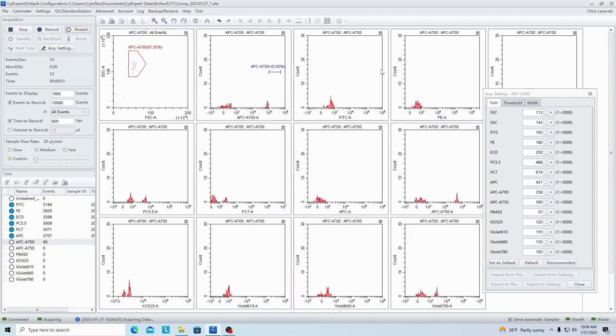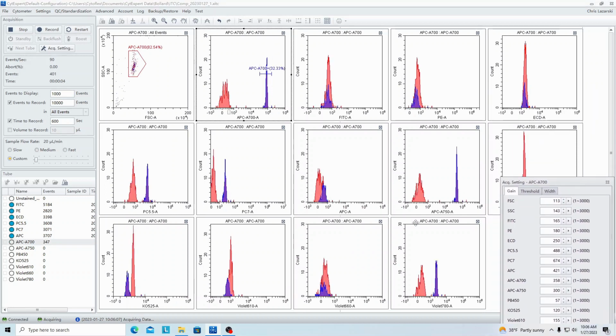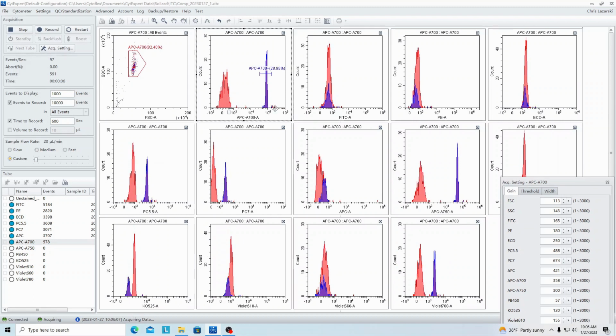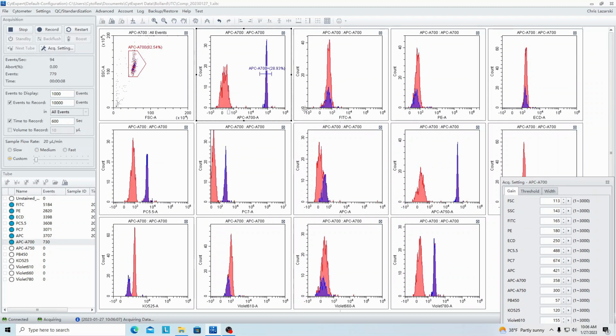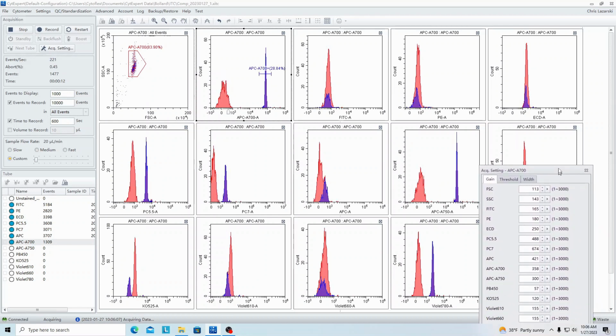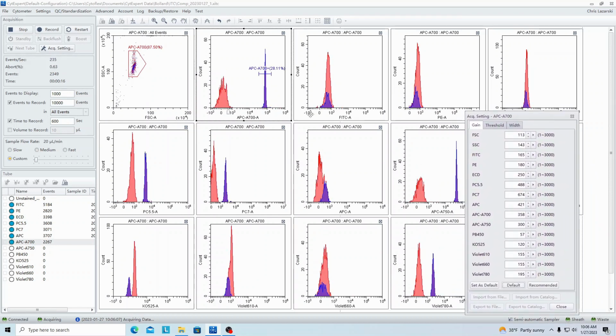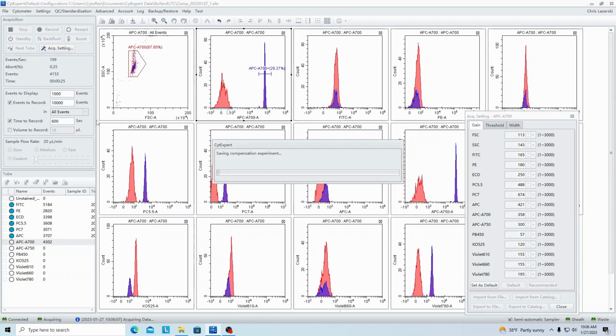Restart. So now let's compare this. Likely it is going to be close to 750, but 700 is still at a different level than 750. Let's try that.